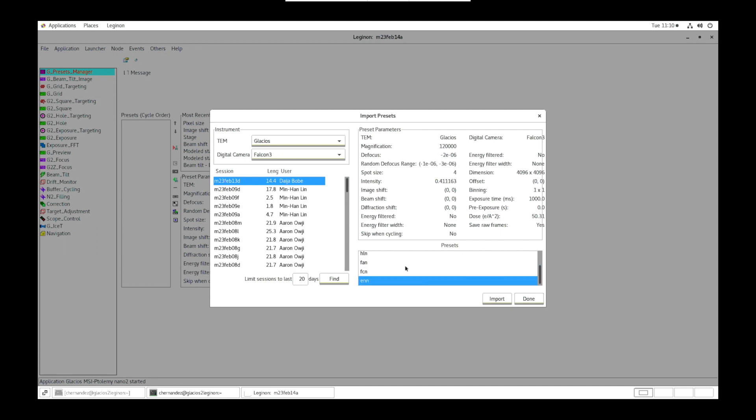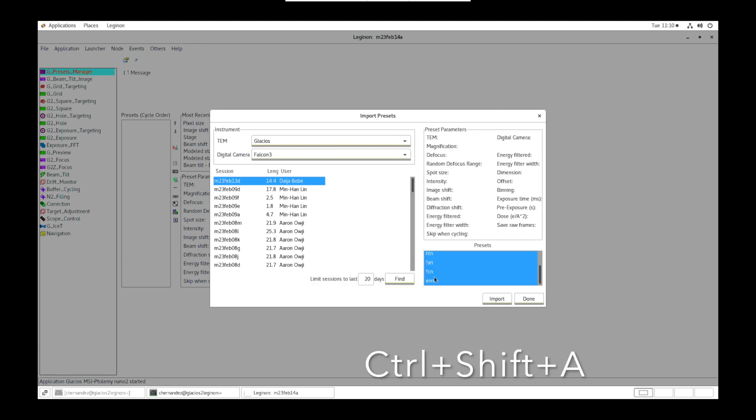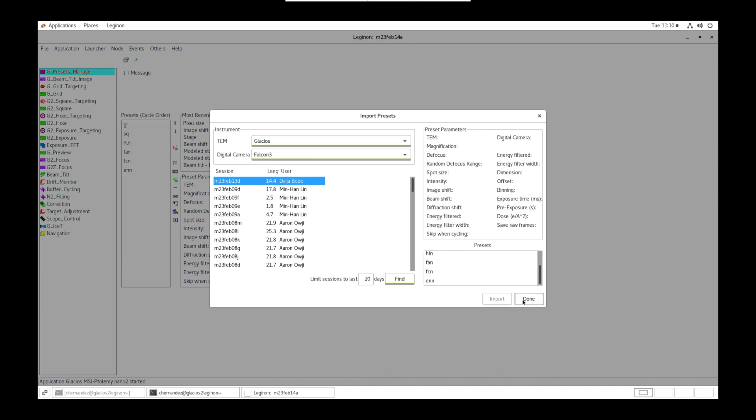If satisfactory, control shift A to select all, import and done.